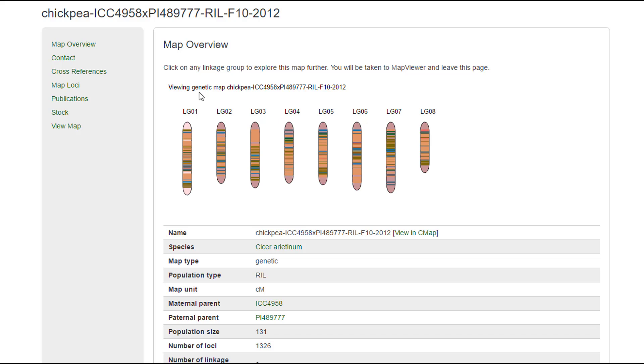Right now I'm showing you how to access it from the Map Overview page. On the Map Overview summary there is a graphical representation of all the linkage groups associated with the maps.